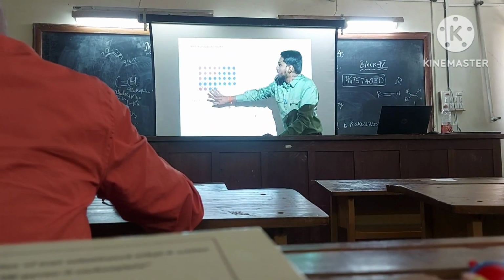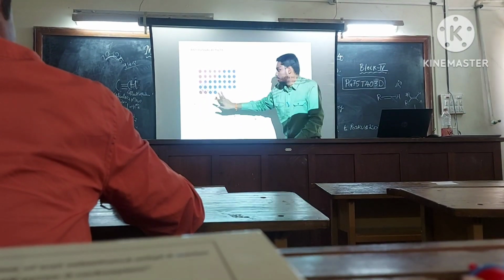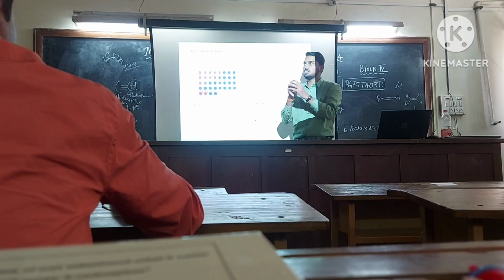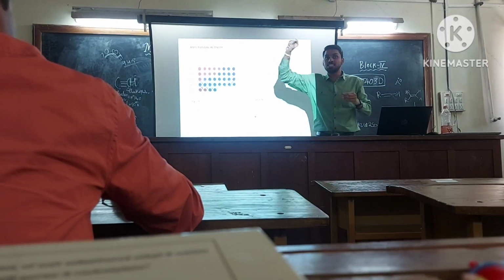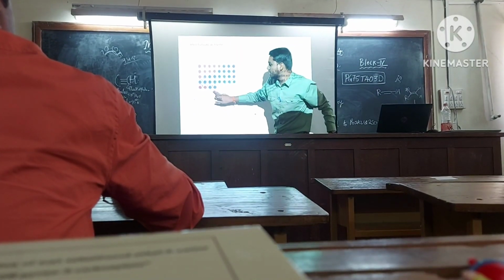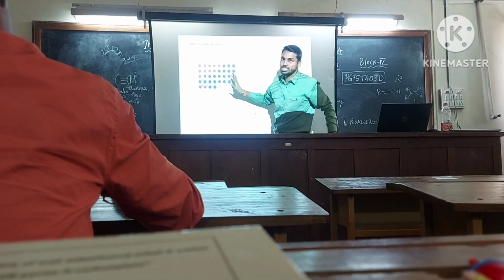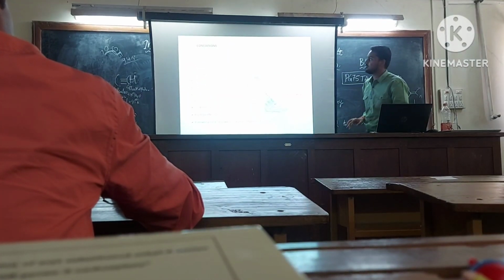Positive means the organisms are still alive, like the pink, they are still alive. Negative means like you see this. If you want to plot a graph, then in order to understand the scales and all, we write the scale at the corner. In a similar fashion, we are using it as control reagents. So negative means that it has died. So that is the indication mark. So these are the conclusions that we can draw.